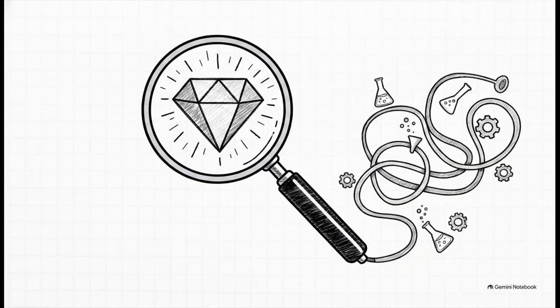This brings us to the illusion of precision. You might get a report that says you have exactly 4.327 parts per million of a certain metal. That highly specific number looks incredibly trustworthy, right? I mean, it's got 3 decimal places. But a single number is never the whole truth. Its true value depends entirely on how it was generated, the sample preparation, and the metrics running behind the scenes. Without that context, that precise little number might actually be leading you completely down the wrong path.